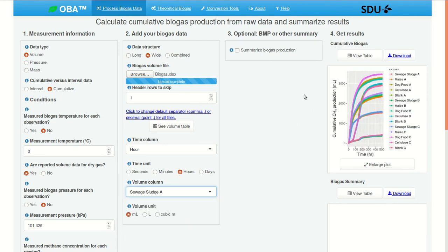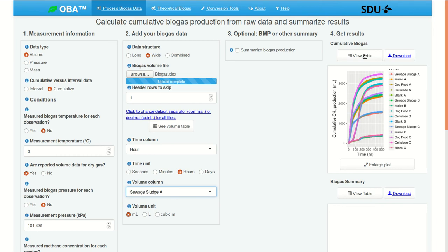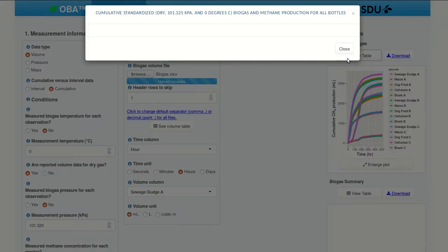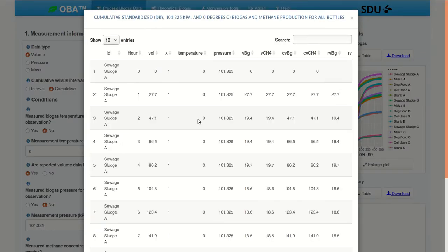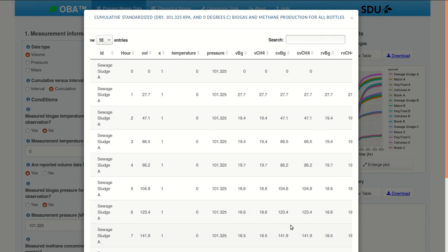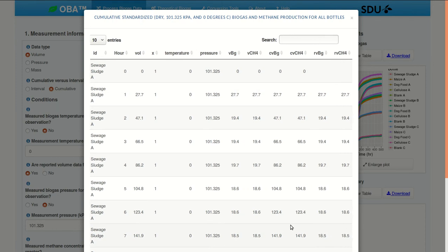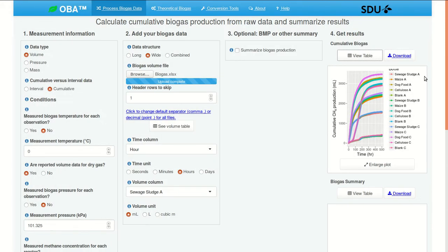There we see our results. Really just cumulative methane production. Really all we've done so far is read in the results. Because this is what we started with. Although, if you view the data, you see a bit more information, including the rates of methane production. And here, these would be milliliters per day. These can be downloaded as well with this link.